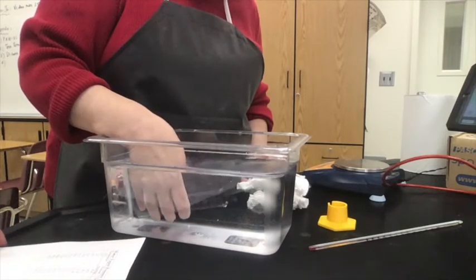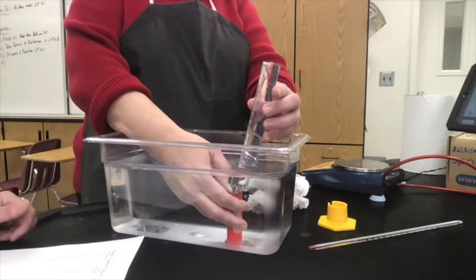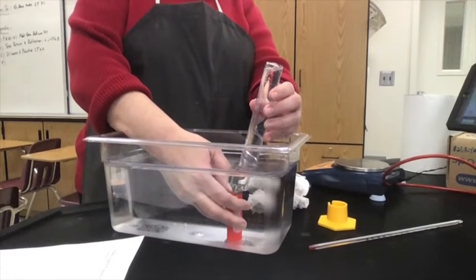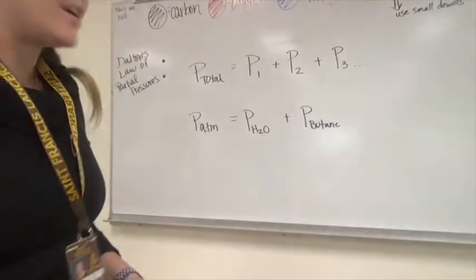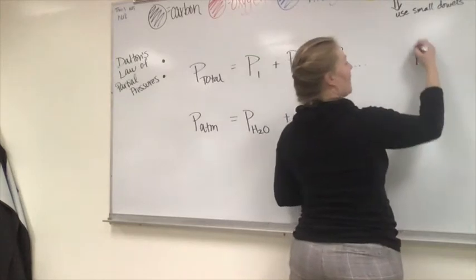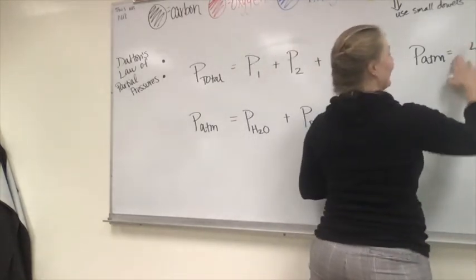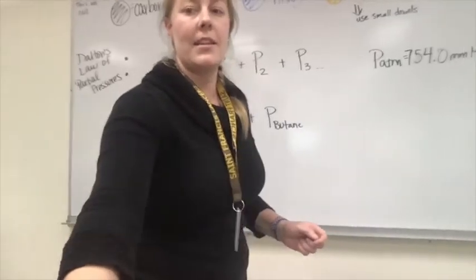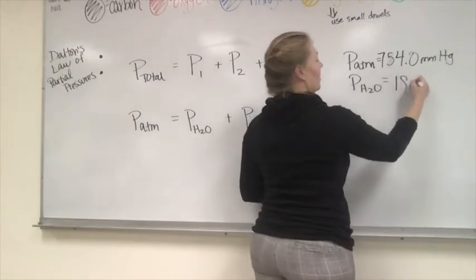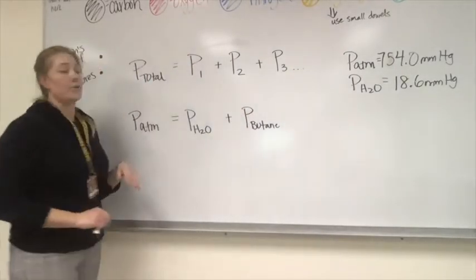For trial three, remember that the final mass from trial 2 can be your starting mass on trial 3. Here is the tube filled with water — I'll start collecting and we'll pause so you don't have to watch the full collection. Meanwhile, let's go over the partial pressure equation. Our atmospheric pressure was 754.0 millimeters of mercury, and the vapor pressure of water, the pressure of H₂O, was 18.6 mmHg at 21.0 degrees Celsius.